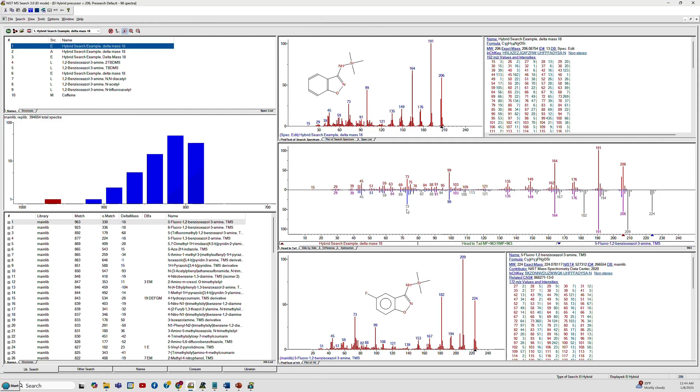In the search itself, the hybrid search is actually two searches that are combined into one hybrid score. It first does the standard identity search, which in this case is the bottom part of the spectrum. But then it goes and shifts the ions by this delta mass that it has determined, and then compares the top part of the spectrum or the loss part of the spectrum.